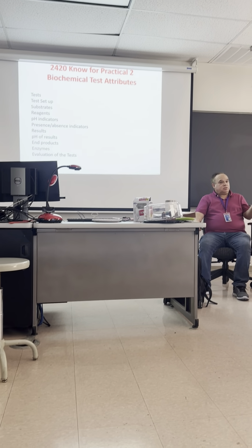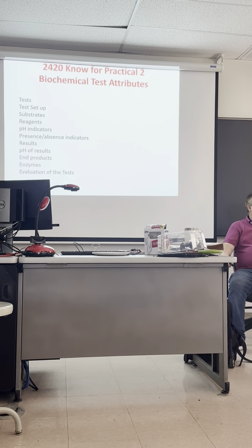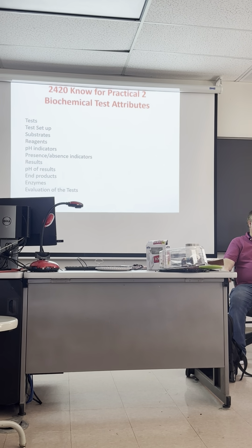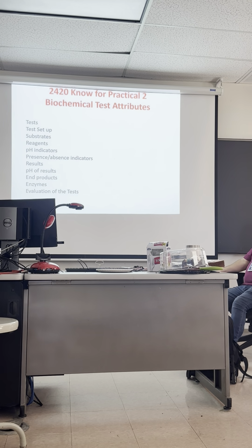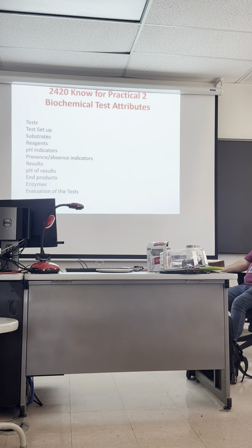You all. It's under Practical 2, under practice test or something like that. You need to know a test: the test setup, the substrates, the reagents, the pH indicators, the presence/absence indicators, the results, pH of results, end products, enzymes, and how to evaluate the test. Okay? So let me just give you a couple of things that you should know to make your life easier.